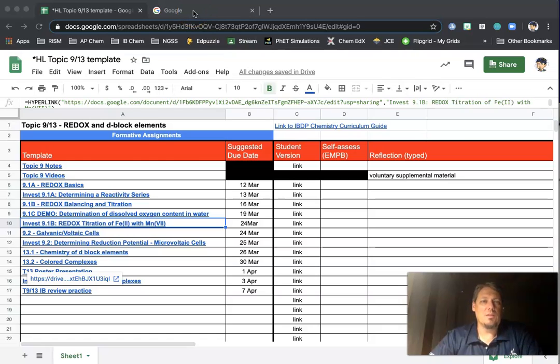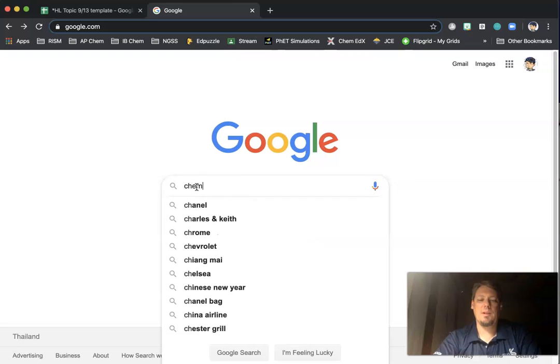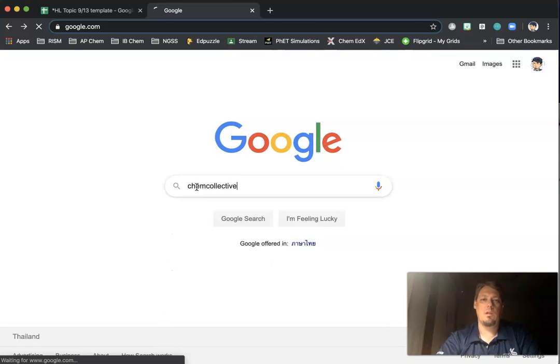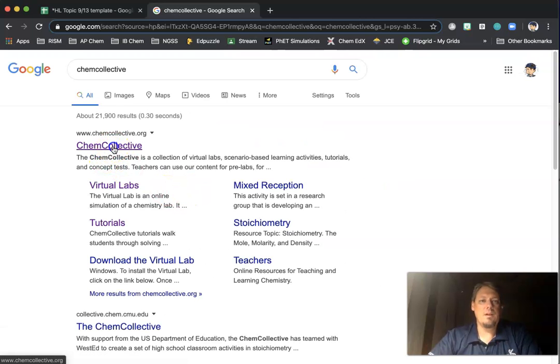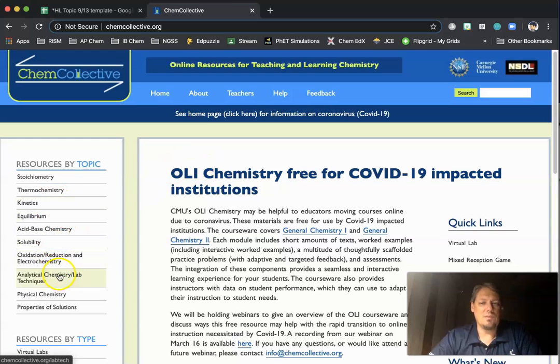So to get to the simulation, you're going to go to Google, and you're going to type in Chem Collective. Yeah, my audio didn't record correctly, so I am doing a voiceover right now. Once you get to Chem Collective, it is the first hit you get. This is a website put up by Carnegie Mellon University in Pittsburgh and the National Science Foundation.